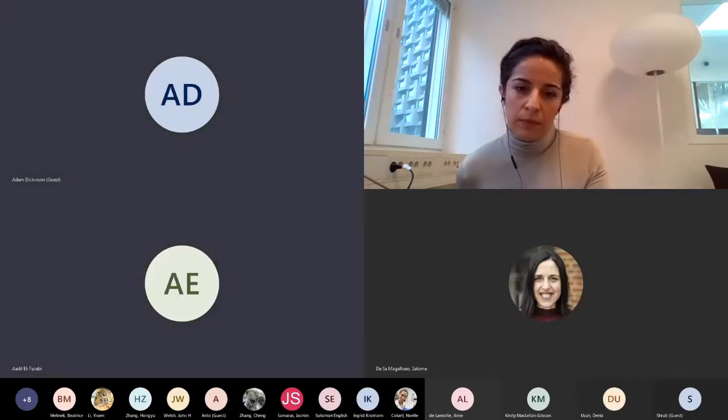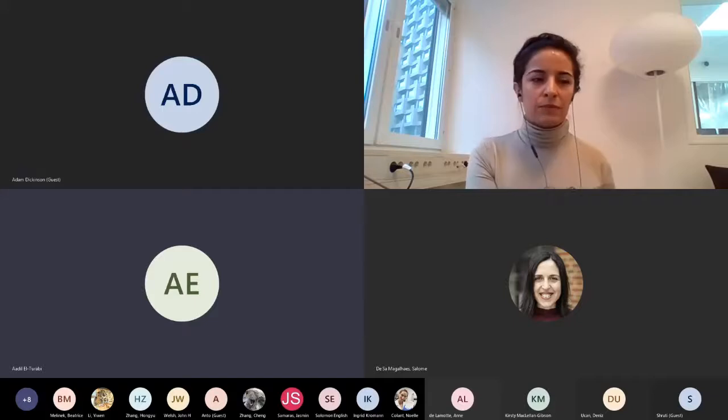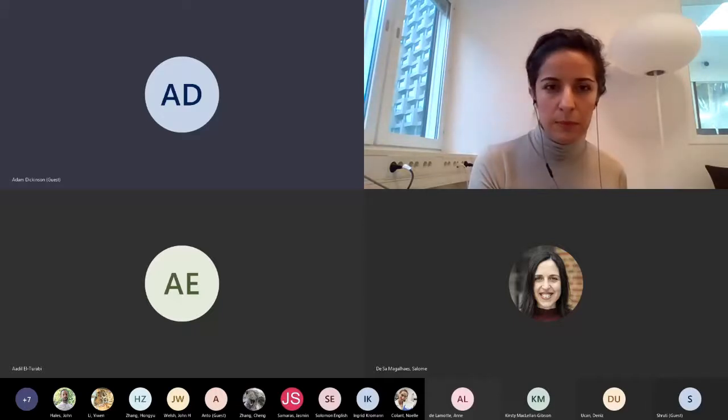I guess it's about trying to get a good representation on your grid. So what kind of concentrations would you recommend? I think for viral particles, we're typically looking at 10 to the 9, 10 to the 13. It's not always possible to do that. I'm aware of that. Obviously, the more the better, but you have to take into account the size of the particles. That was for AAVs, for example. You need less if the VLPs are particularly bigger. It's not the more the better, but plenty is the thing.